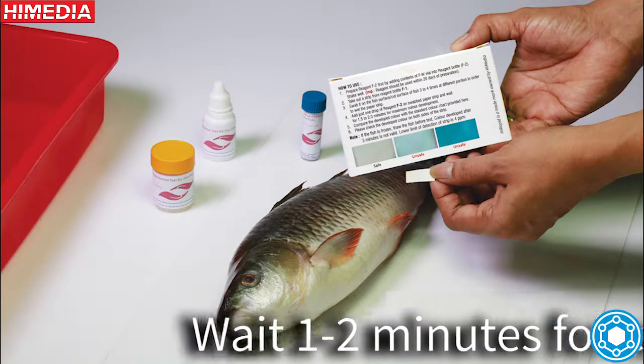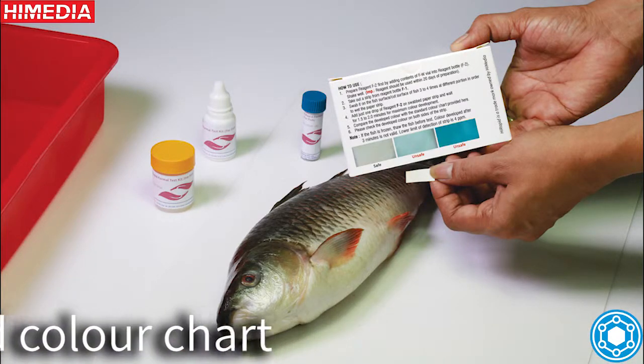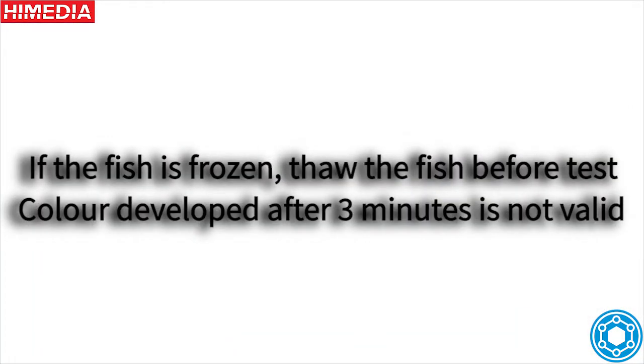Wait one or two minutes for color change. Compare the color developed with the standard color chart. If the fish is frozen, thaw the fish before the test. Color developed after 3 minutes is not valid.